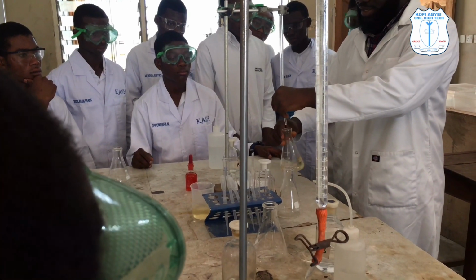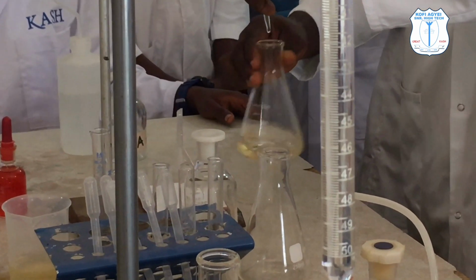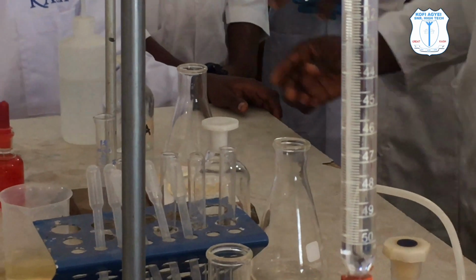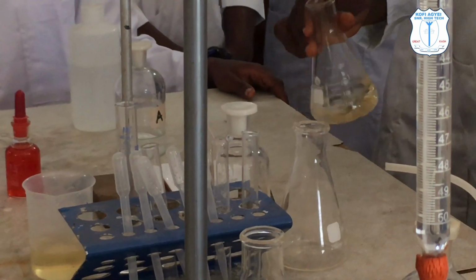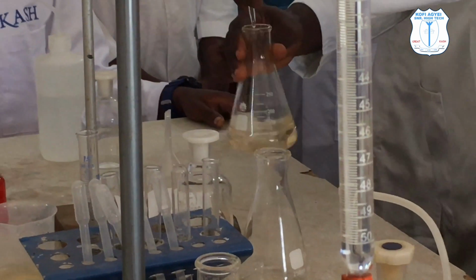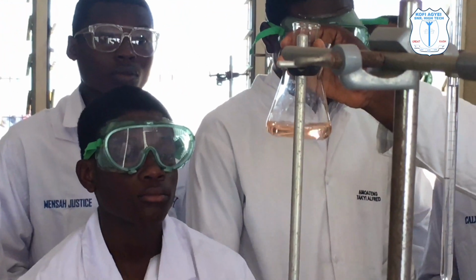Have you seen the color is changing? Yes. So when it gets to this point, you need to be very careful because the color change can come at any point in time. It's still yellow, right? Obviously there's a color change. So this one is what?